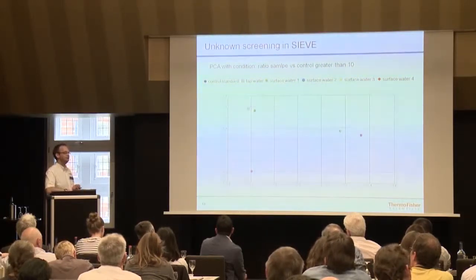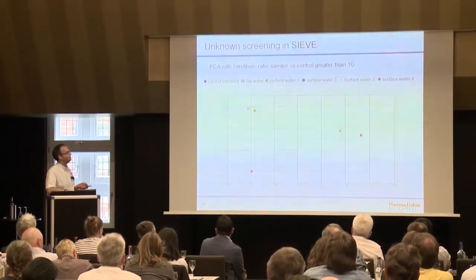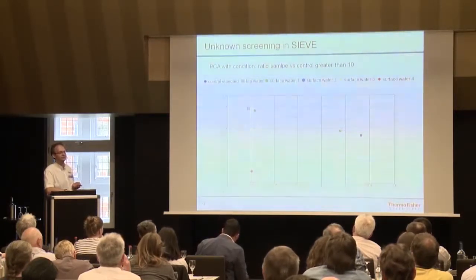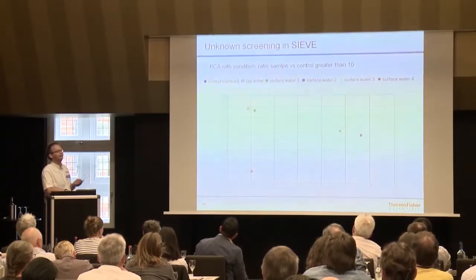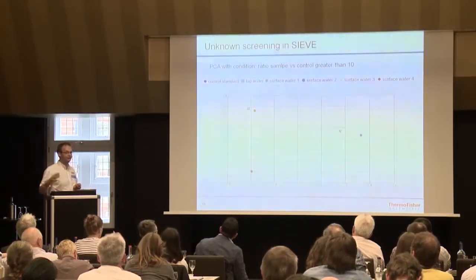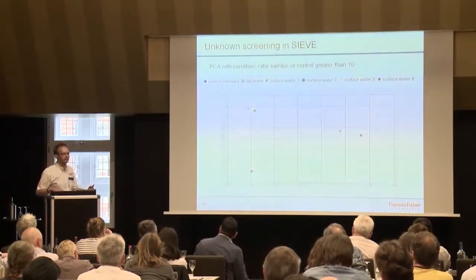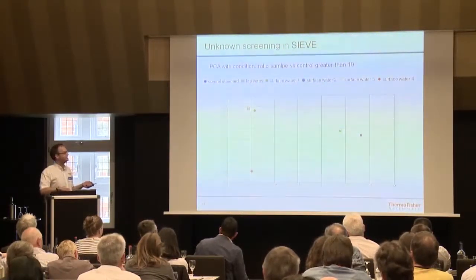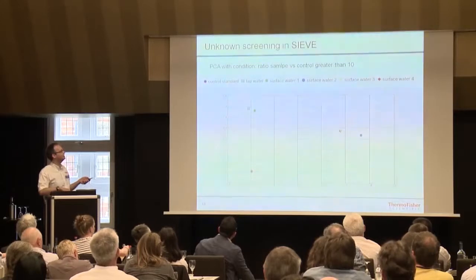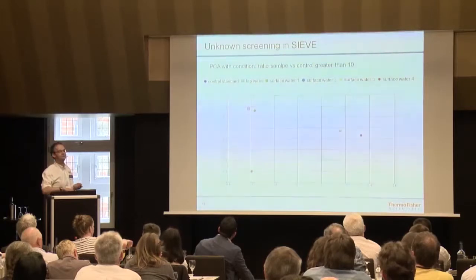And what's going in? These are 2 surface water streams. They are mixed in the plant, and then they come out of the plant. And what we see here, surface water 1 is a rather clear, pure stream. Surface water 2 is a rather dirty stream, because only 4 kilometers upstream is the biggest real wastewater treatment plant of Berlin. So all the efflux from this wastewater treatment plant goes into that stream. And then the fluxes are mixed. That's the intake of this precipitation plant and the efflux. And what we see here, that's the rather clean stream coming from the outskirts of Berlin, which is rather closely related to the tap water. It's clean.